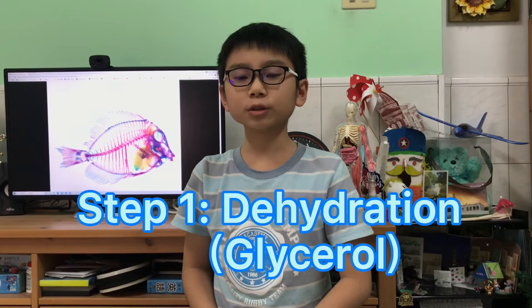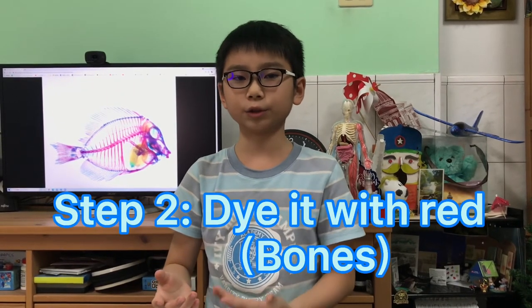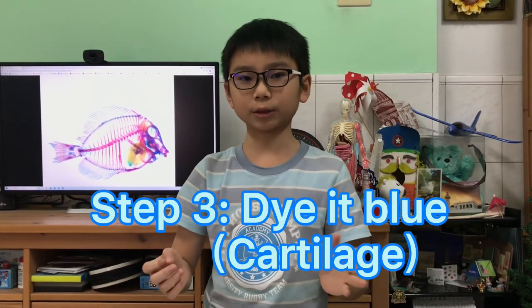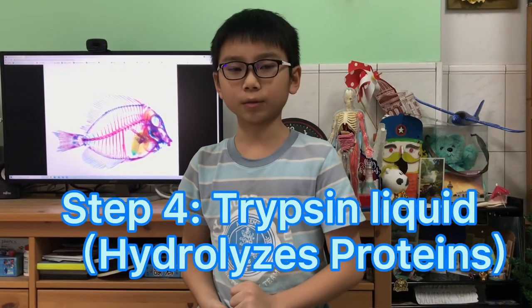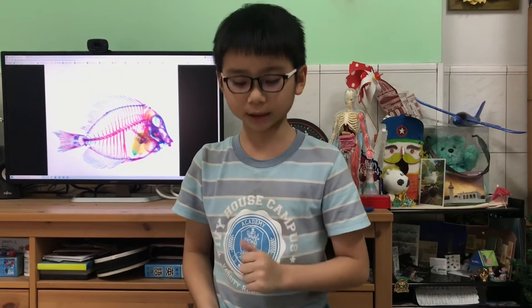The process mostly consists of a few parts. First, you need to dehydrate the specimen with strong alcohol — glycerol or glycerin. Next, you need to dye it with colors: blue for the cartilage and red for the bones. You also need trypsin liquid, which is the main thing that makes the specimen transparent, because it hydrolyzes proteins.